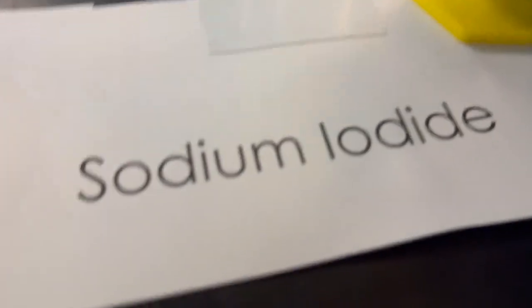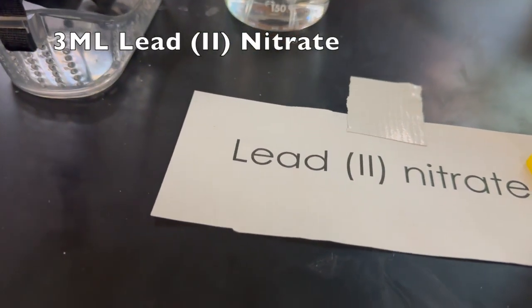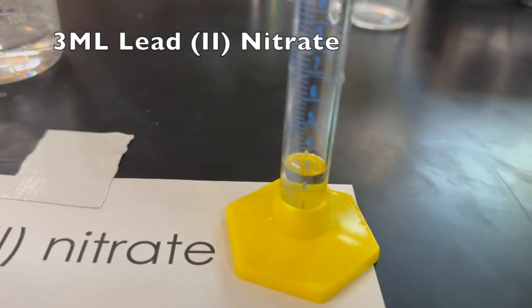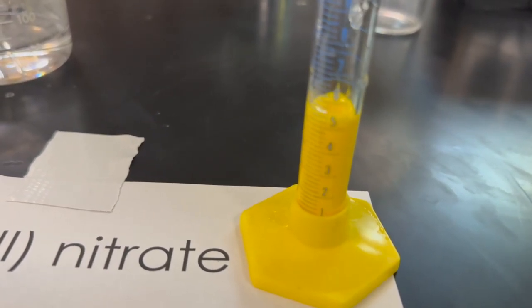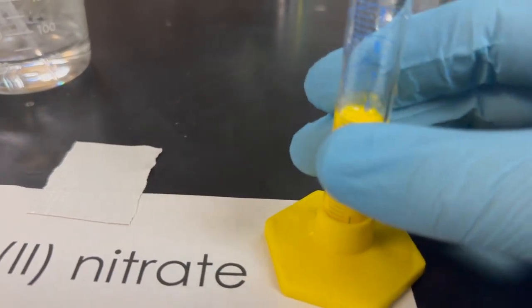And next, we're going to move on over to the other side of the table, and we're going to put some lead 2 nitrate. So remember, the 2 is the charge. So when you write this formula out, you're going to do a double replacement reaction, figure out and balance this reaction, and run both 3 milliliters of lead nitrate, or lead 2 nitrate, and 3 milliliters of sodium iodide.